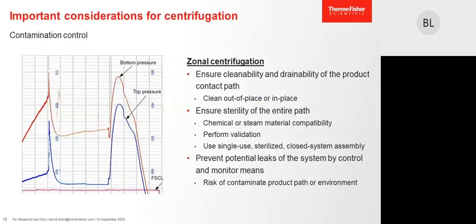The graph is showing pressure differential control, having the stream of products at the highest pressure, then the utility pressure will ensure, in case of leaks or seal defects, that the product is safe because of the highest pressure.